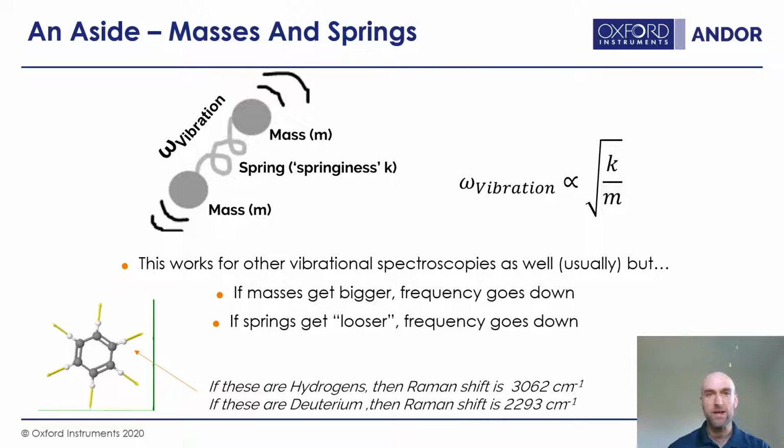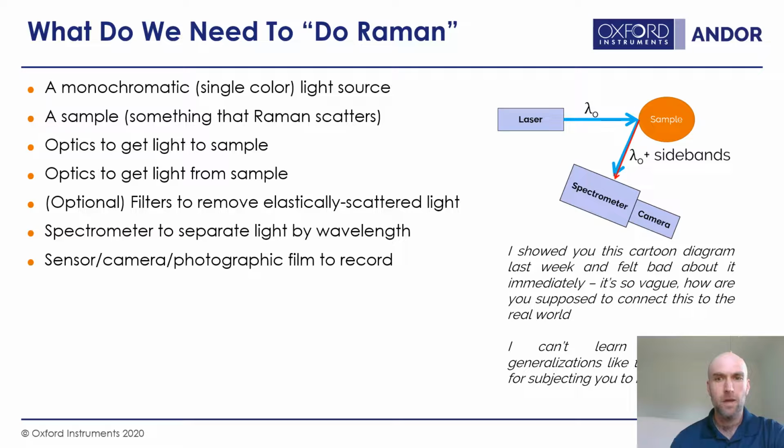But first we're gonna talk about the practice of Raman. How is it actually done, the logistics? A little bit anyway. So what do we actually need to do Raman? That is to say, to actually get the measurement. Well, let's go into this with an idea of our bill of materials, or our requirements.